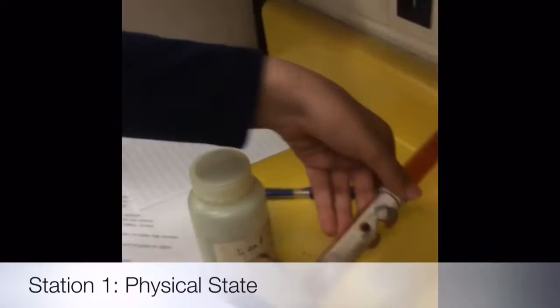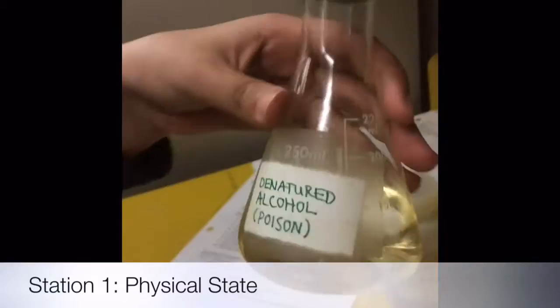The lead is a solid in multiple pieces. The denatured alcohol is liquid, see-through, watery, and yellowy in color. The corrosive poison is gas, red and see-through. It's trapped in there so it doesn't move.